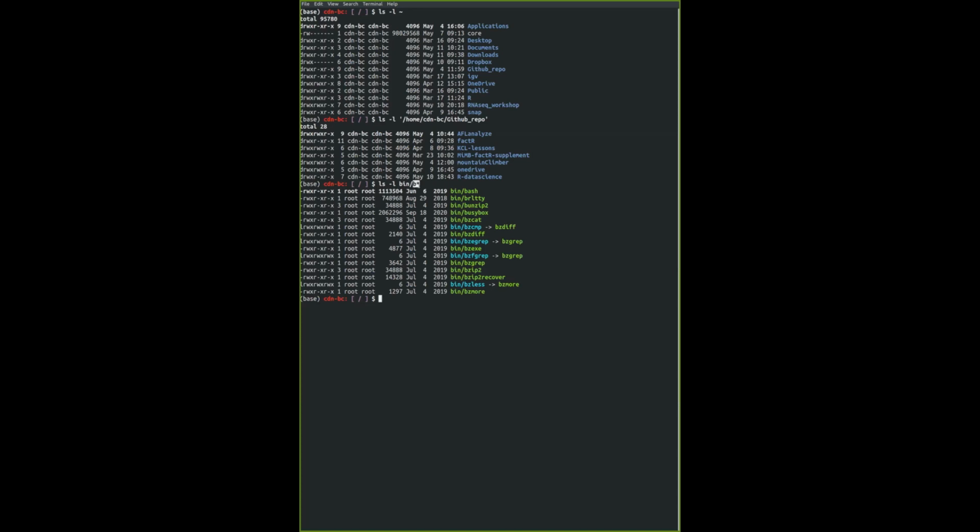What this means is to print out files that begin with B, and it doesn't matter what follows the letter B, print out anything as long as it starts with B. If you want to do it the other way, to print out a file that ends with B, you will start with the asterisk and then type B. So the file will start with any alphanumeric character, but then it has to end with B. I don't know if this will return anything. It does. It returns 2 files on my computer that end with B.